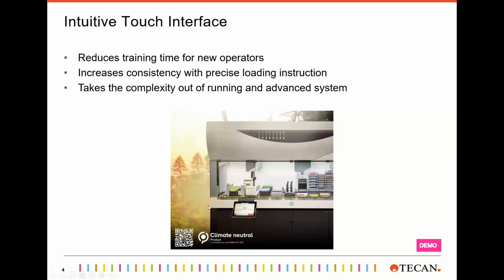First of all, I don't know if you can all see my mouse, I hope you can. If you have a Fluent, as standard it comes with an attached touch screen. So here at the front, you can see a touch screen, and on there we run touch tools. This is the interface that the operator of the Fluent sees and interacts with, and it's very, very intuitive and very customizable. You can show pictures, videos, and make it really easy to operate the instrument and run a script. And to show you how easy it is, I'm going to go right into a demo.